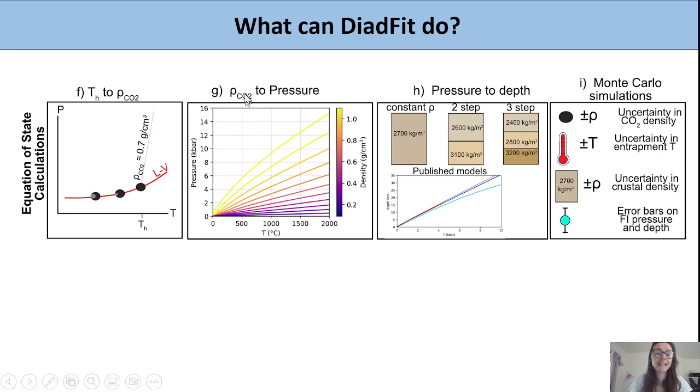You can also convert the density of CO2 to storage pressure or entrapment pressure at a variety of temperatures. This is using the equation of state to relate these variables. This is your common workflow for fluid inclusions once you've determined their density using microthermometry or Raman spectroscopy.